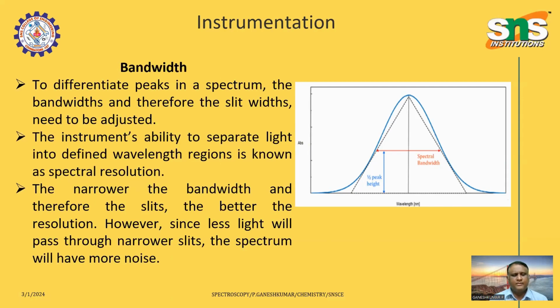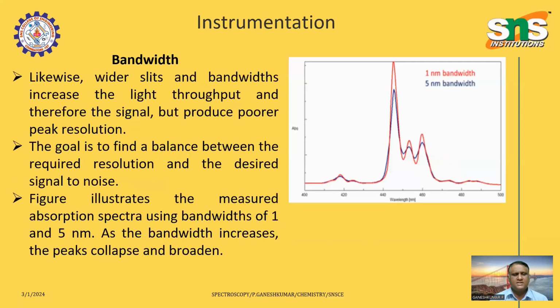Look at these two points: less light, narrow slit, more noise. Wider slit, increase in bandwidth, poor peak resolution. The goal is to find a balance between these two, a good resolution with very low noise. So please look into this picture.